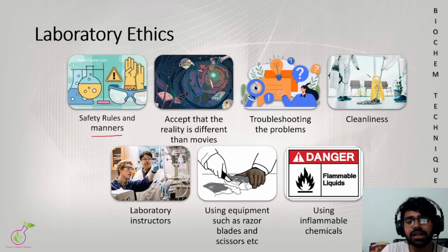So when are the gloves actually required? While working with bacteria, while working with viruses, while working with sensitive biological species, sensitive biological molecules, you use the gloves where we have to be very stringent about the contamination that can occur in the experiment. So that's when you use the gloves. Okay. But glasses when required.